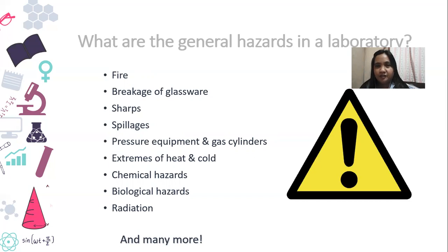I mean, not spillages from the chemical itself, but it's going to be a wet floor, so they have to be careful as well. In the event that you see a puddle of water, please inform me or the laboratory custodian so that we can put a rag or a rubber and silicone mat to prevent the spillage or the puddle of water.